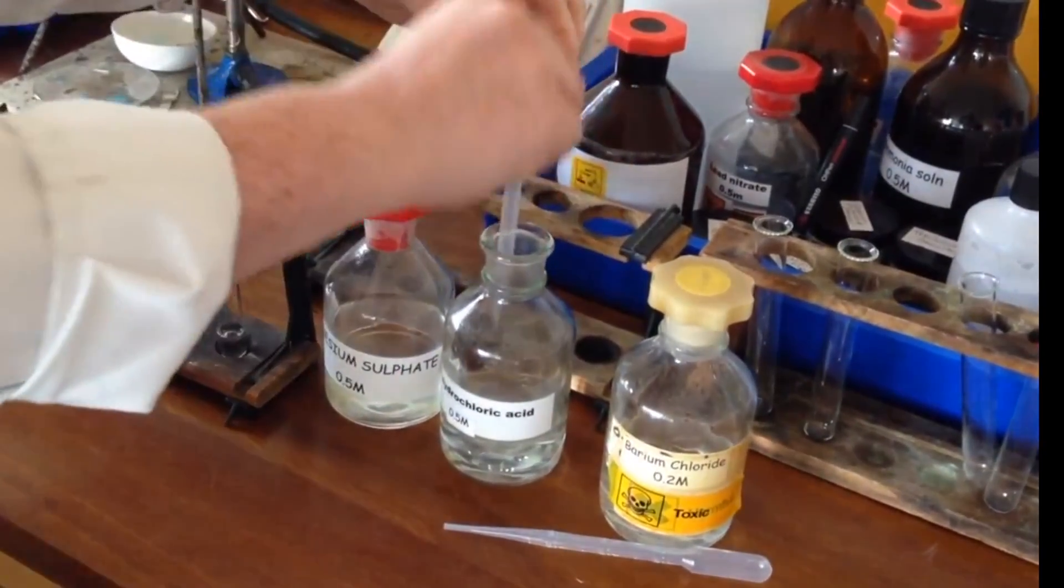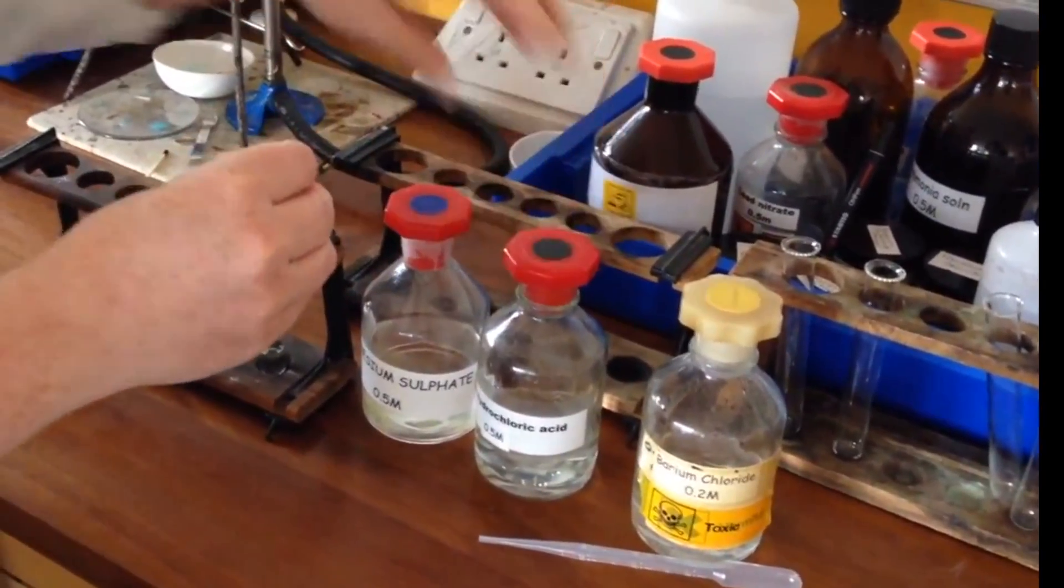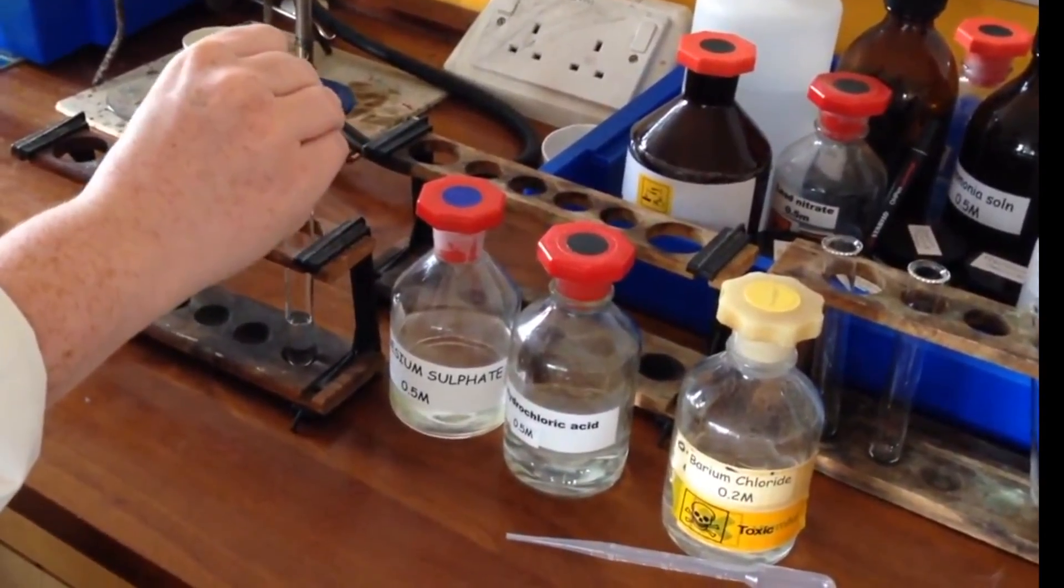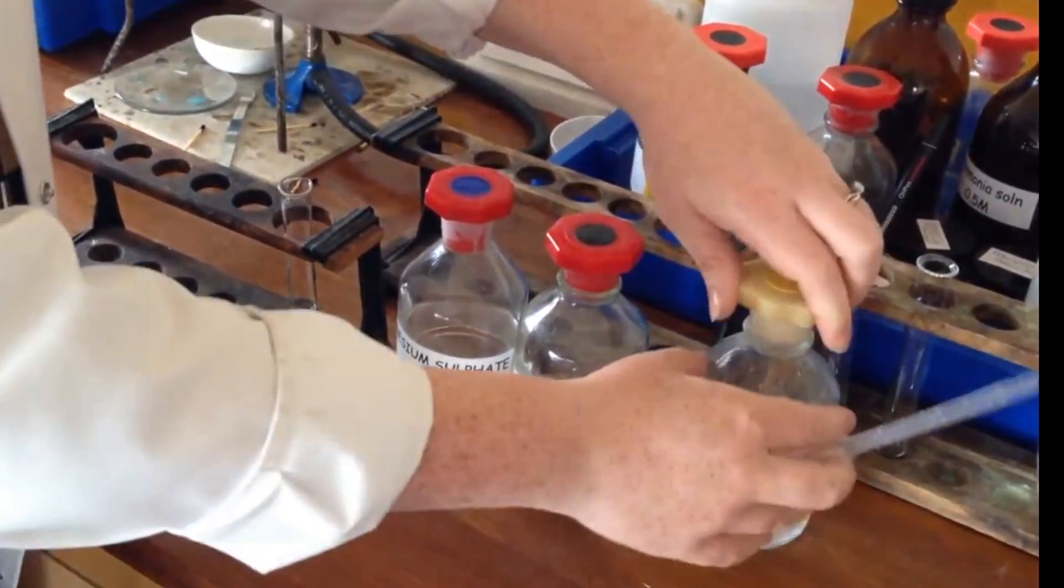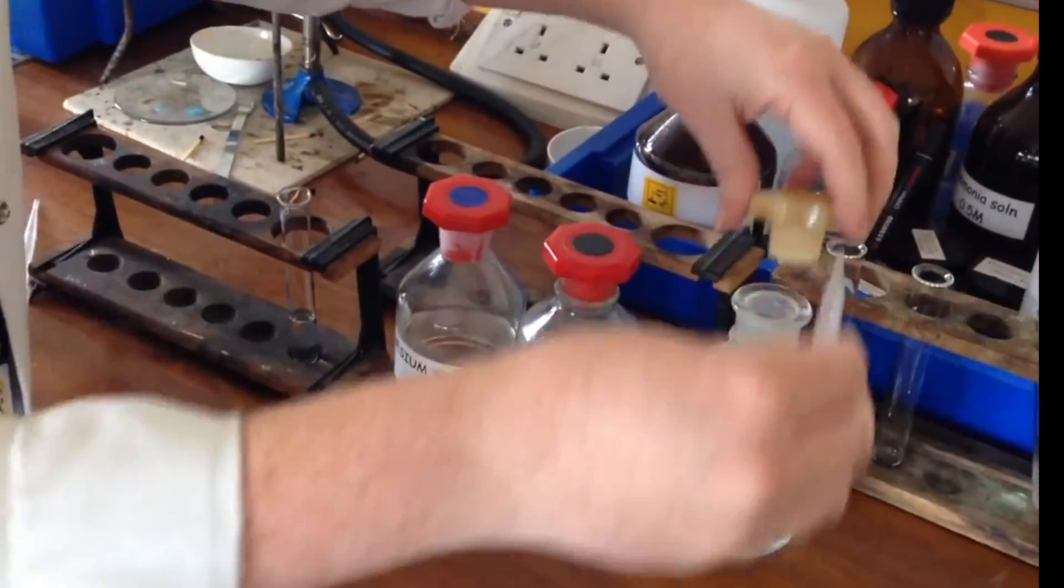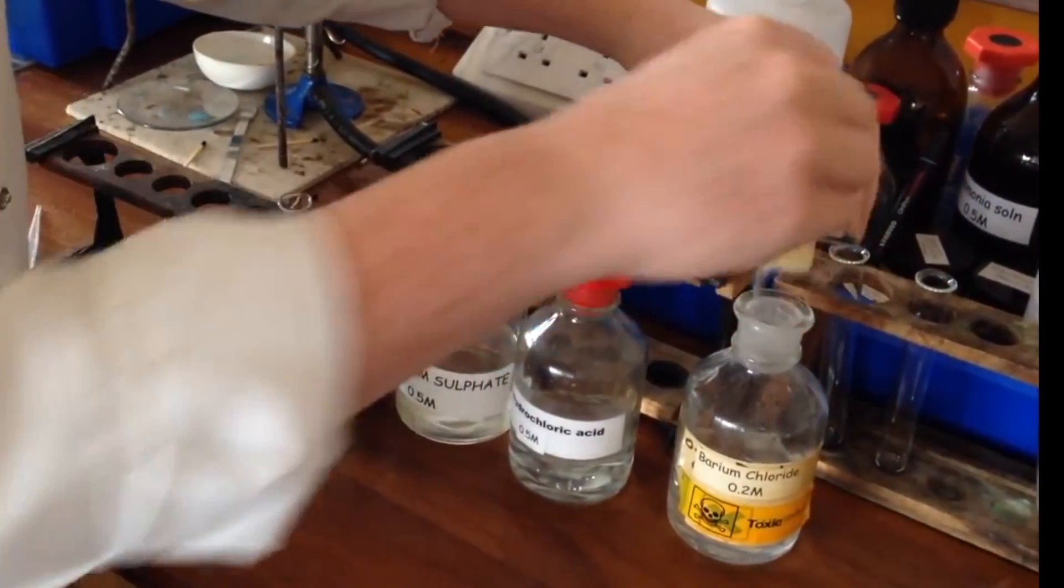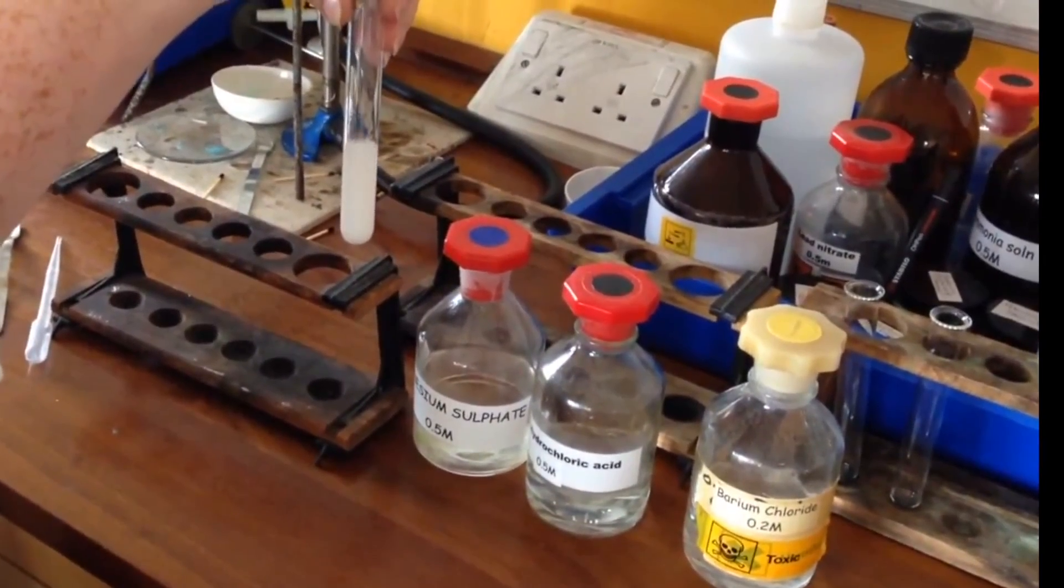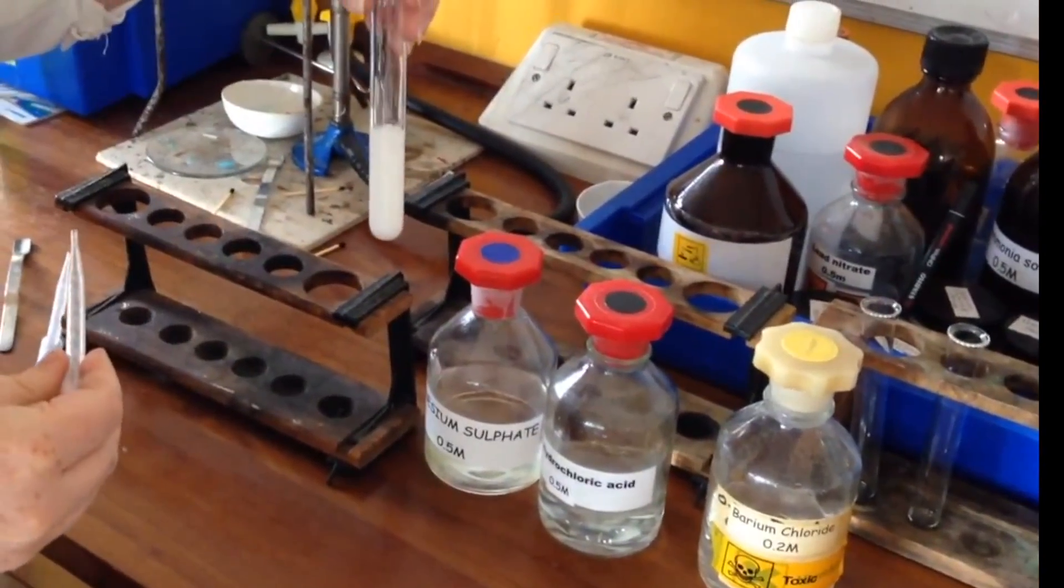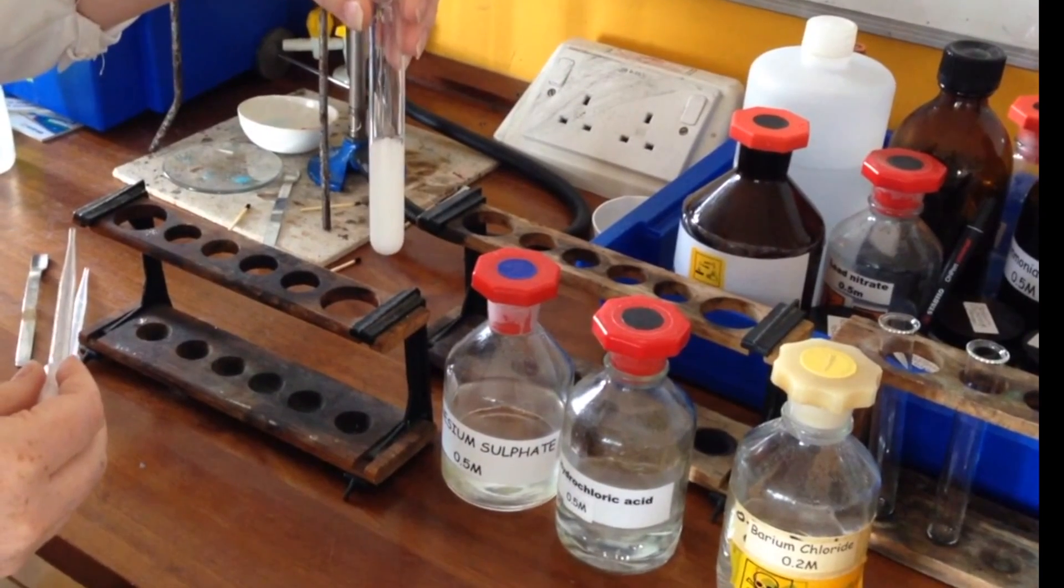I'm trying to get the amount equal. So there's the hydrochloric acid, nothing has happened. We should see something happen when you add in the barium chloride. And now we can see our white precipitate which indicates the presence of sulfate ions.